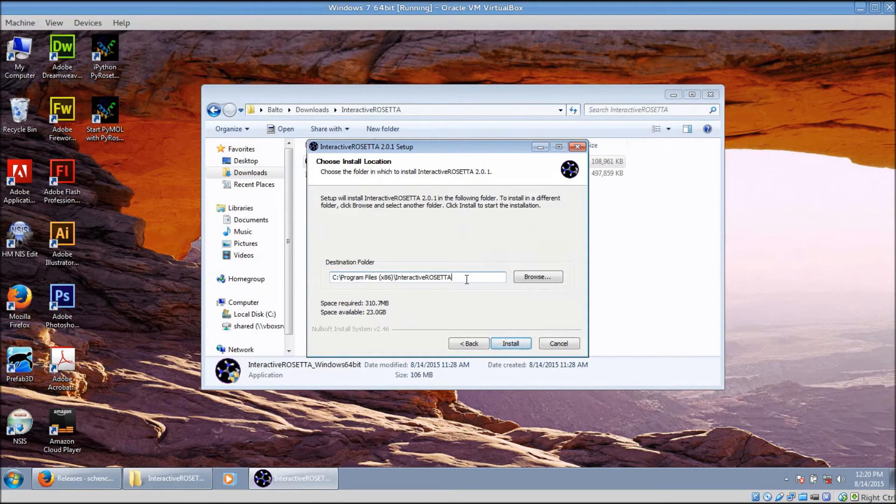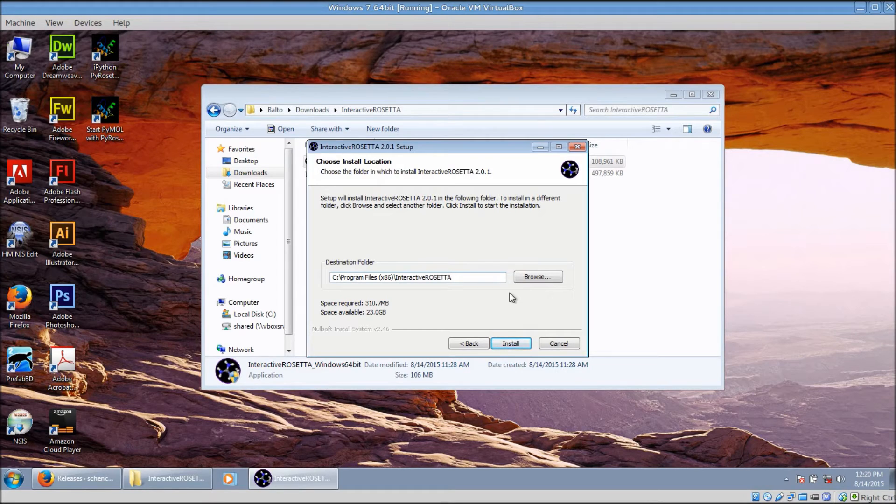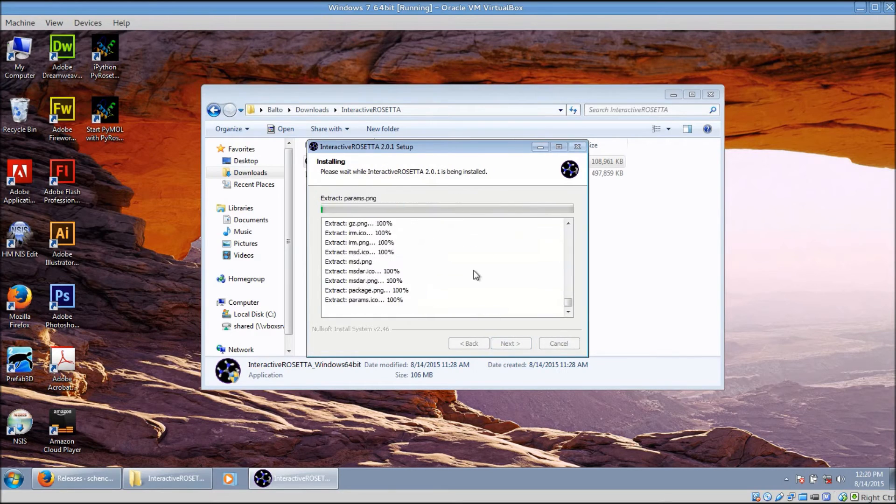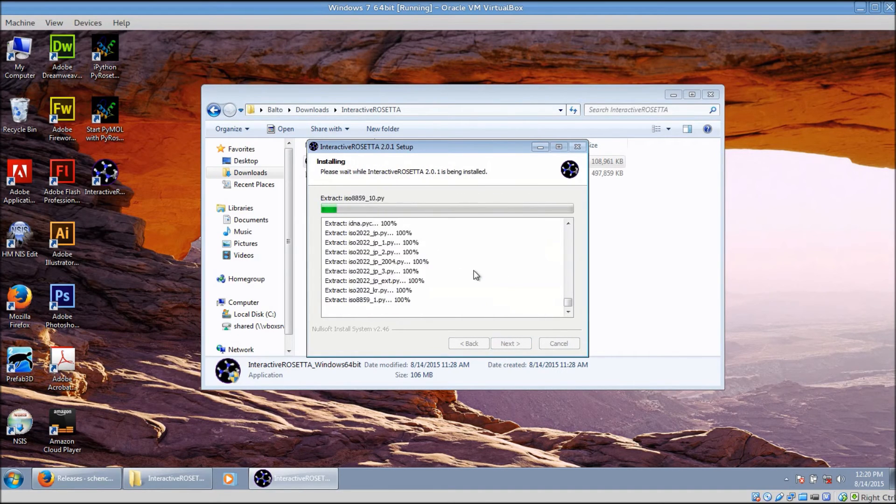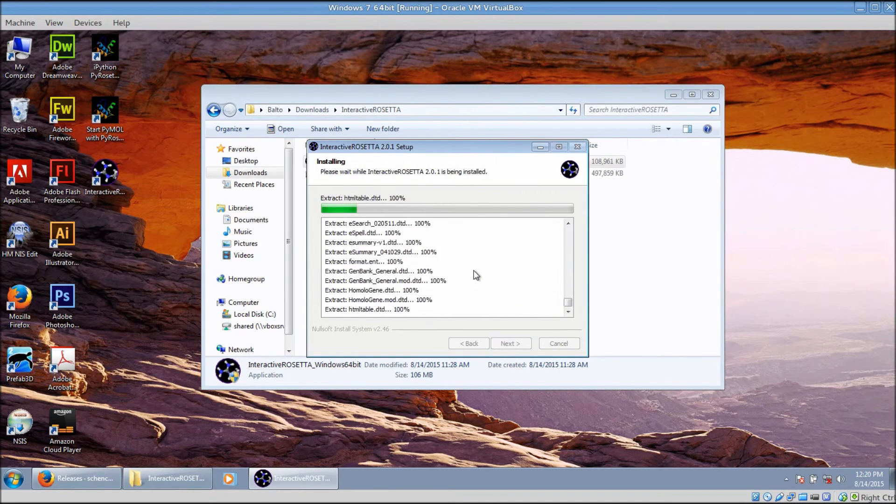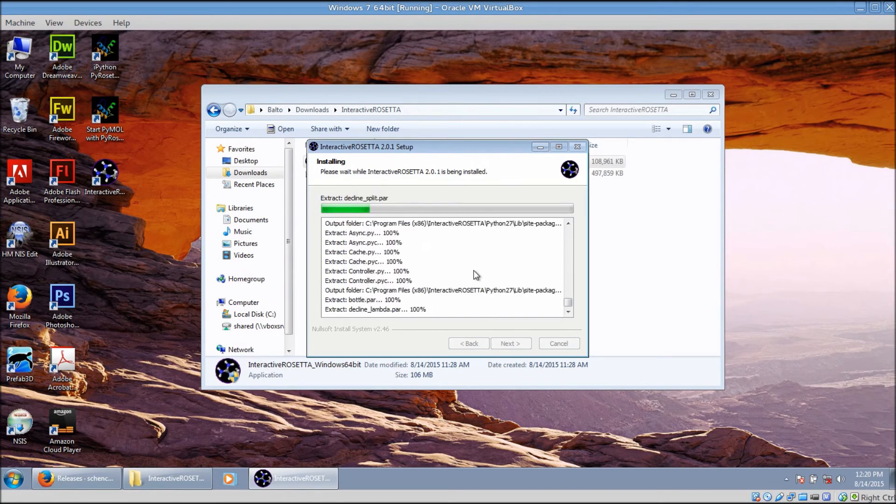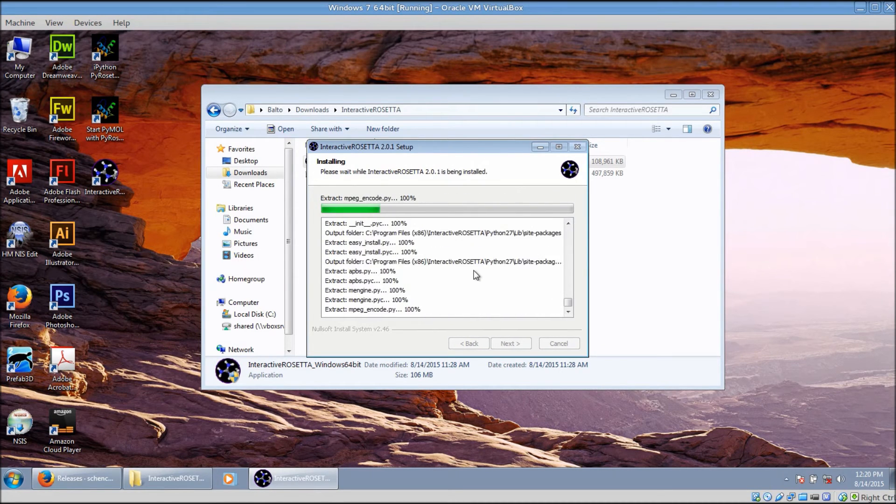When it asks you for the install location, make sure this is the location that you want. It defaults to C Program Files x86, but if you have installed it multiple times in the past it can try to install to a folder within the standard install location. Otherwise, accept all the defaults.